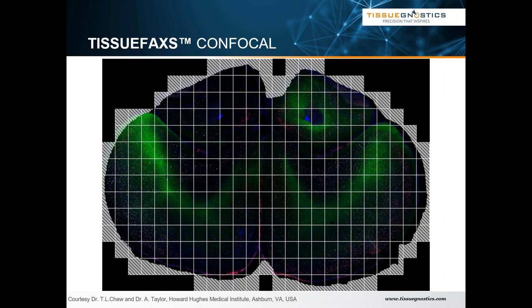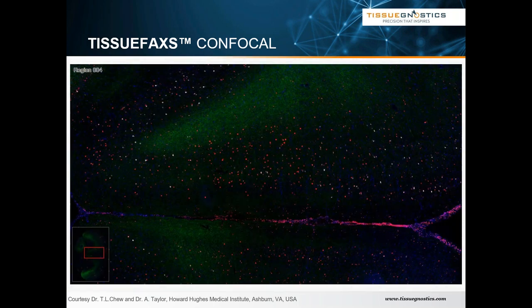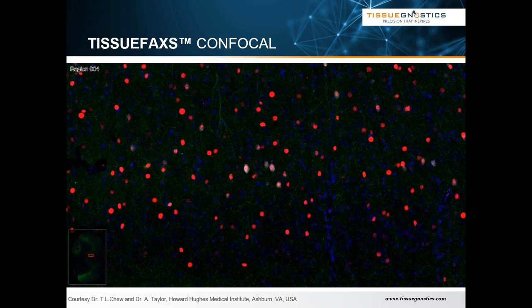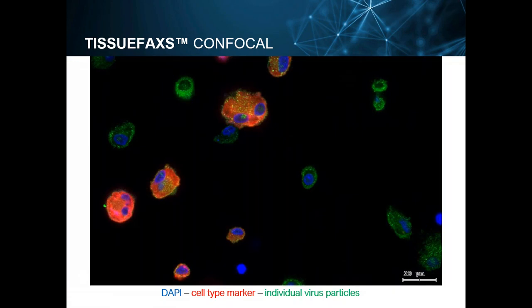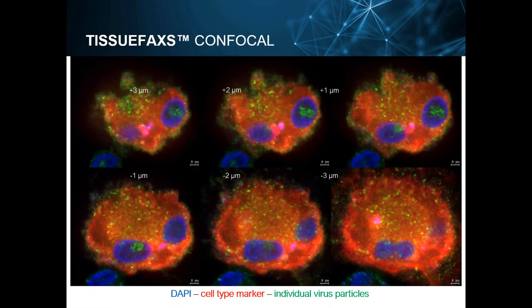The confocal scanners use the same type of workflow: field of view by field of view scanning. Each of those fields of view are stitched back together to create a digitized slide, and then we can zoom in and just enjoy these high-resolution slides. This also applies for cells in suspension — these are HIV-infected macrophages that were scanned with a confocal slide loader in Boston. Here you can see the different optical sections — plus three microns at the top to negative three down at the bottom.